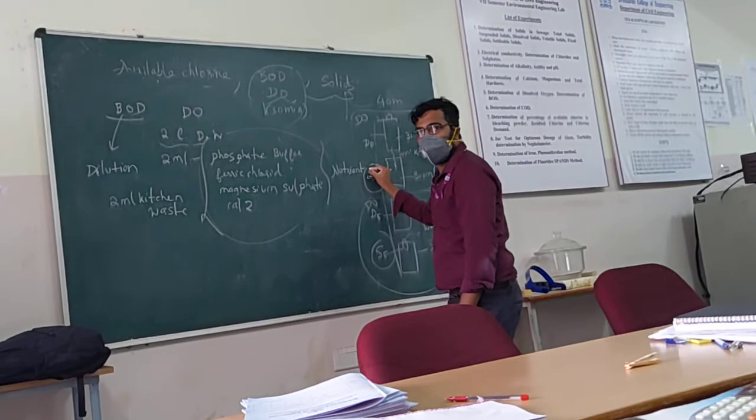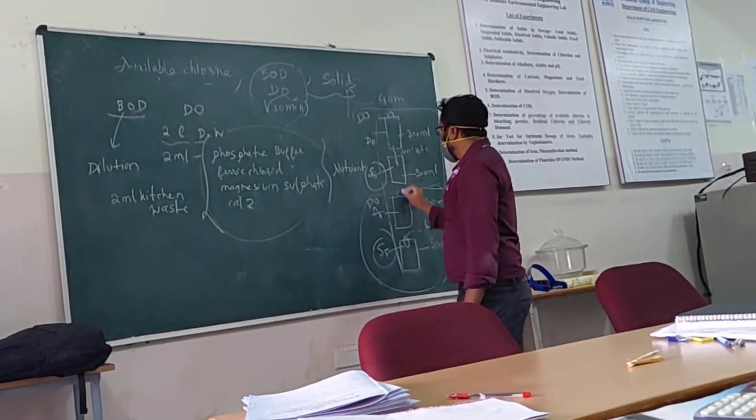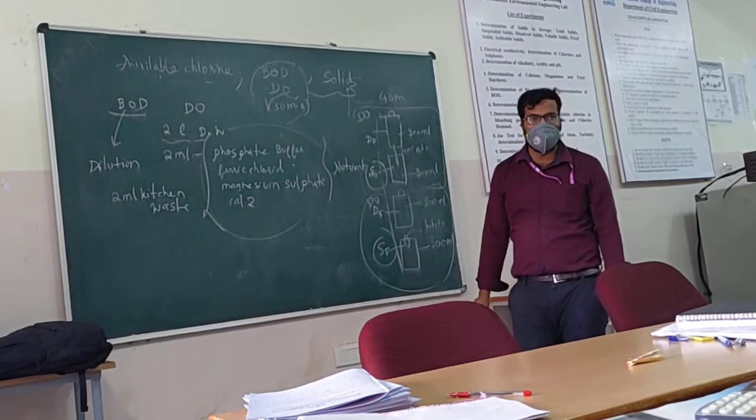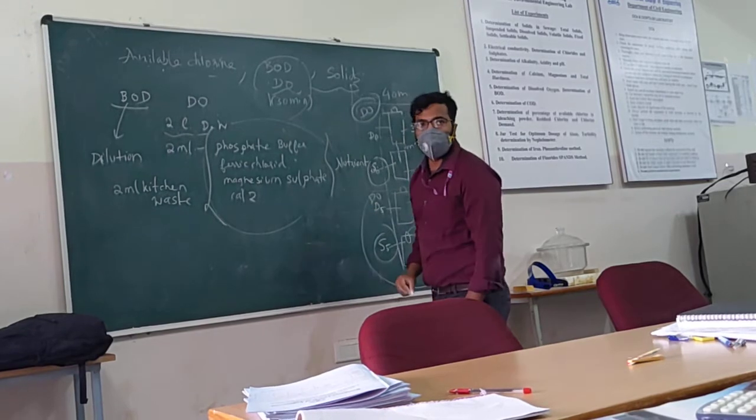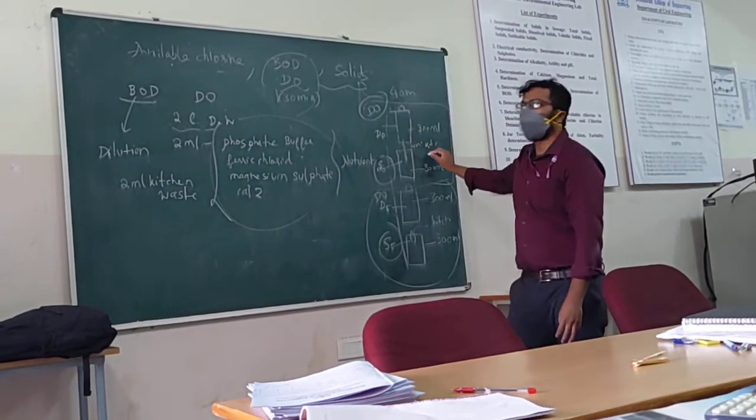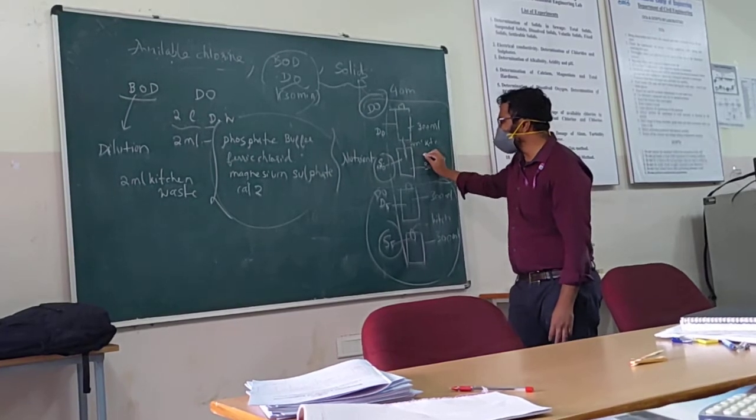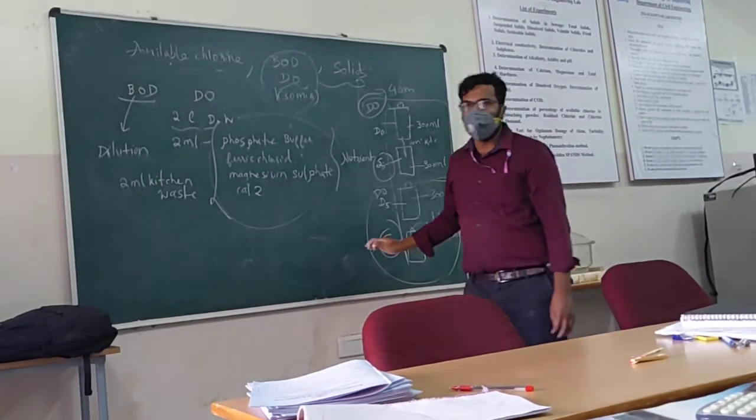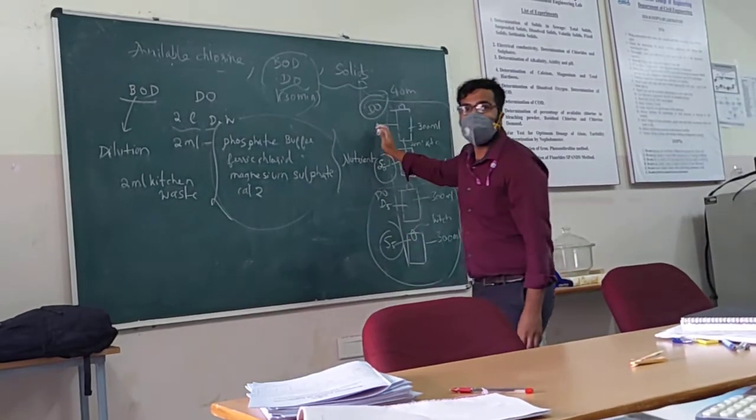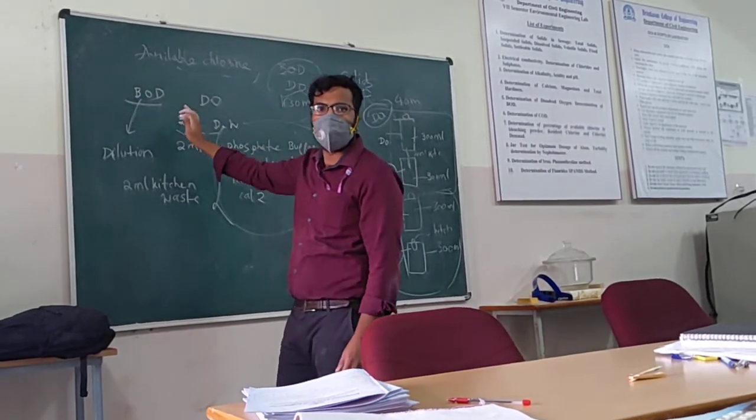And for S, whatever S I have written, for this S bottles, I will add 2 ml of the sewage waste. So after this, I will just conduct the DO, dissolved oxygen, for these 2 bottles. And I will note down the reading. And after 5 days, I will again conduct the DO. So from the difference in the oxygen level, we can calculate.